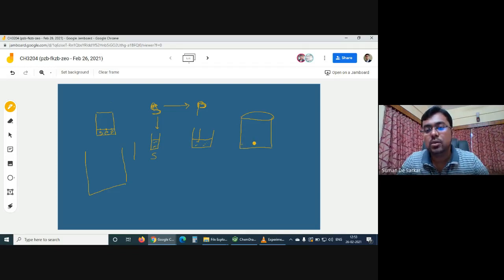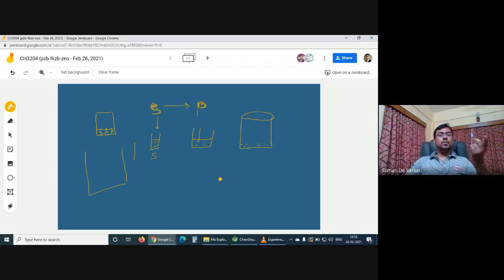It's called the eluent. Okay. This choice of solvent really depends on the characters of the starting material and product. With experience, people will learn this, and sometimes it's also a trial and error method. Normally these are mixtures. The most common is a mixture of hexane and ethyl acetate, EtOAc.